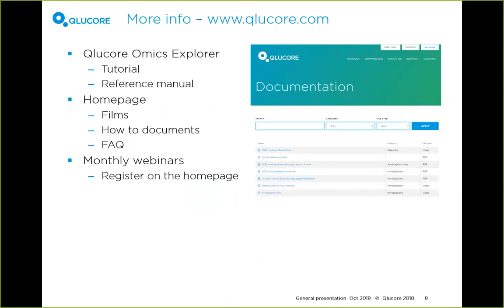I just want to mention as well, for those of you who are already customers, and for those of you who are looking at the software and doing evaluation right now, there's extensive documentation available on the homepage. There's plenty of white papers. There's the tutorial and a reference manual shipped with the software. But on the homepage, there's also films, and older webinars in various subjects that we have done before. So there's plenty of documentation available on the homepage. Please take a look at that if you want to have more information about a specific subject.